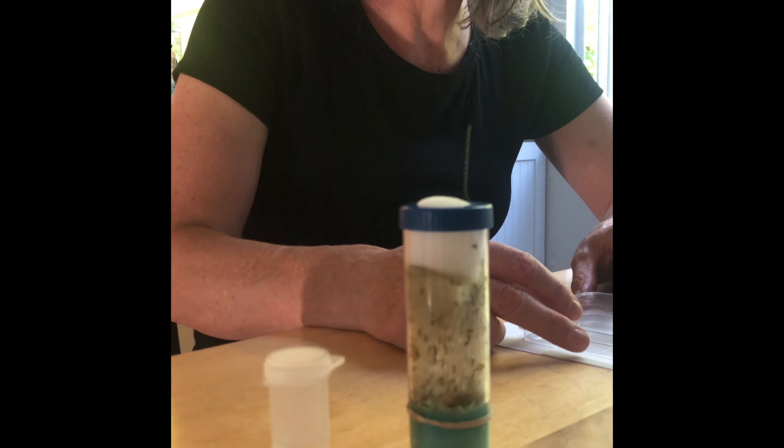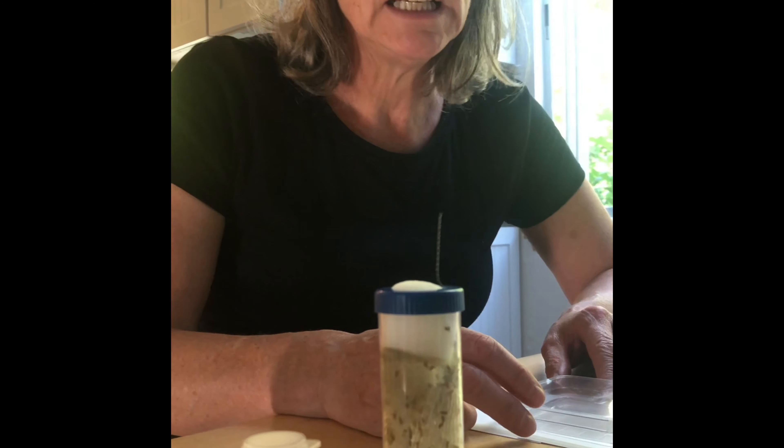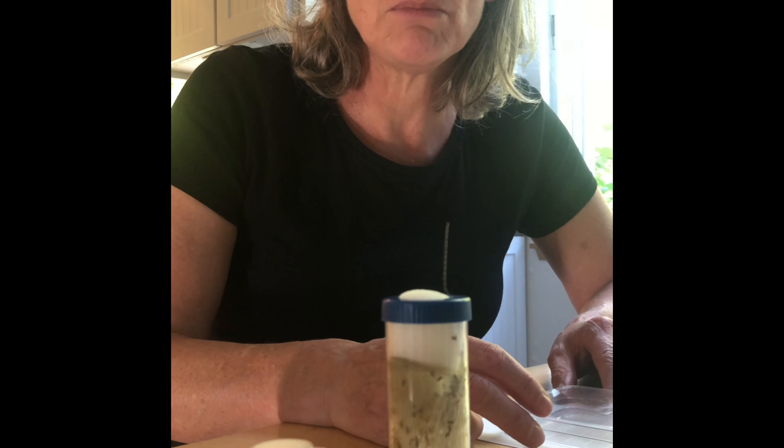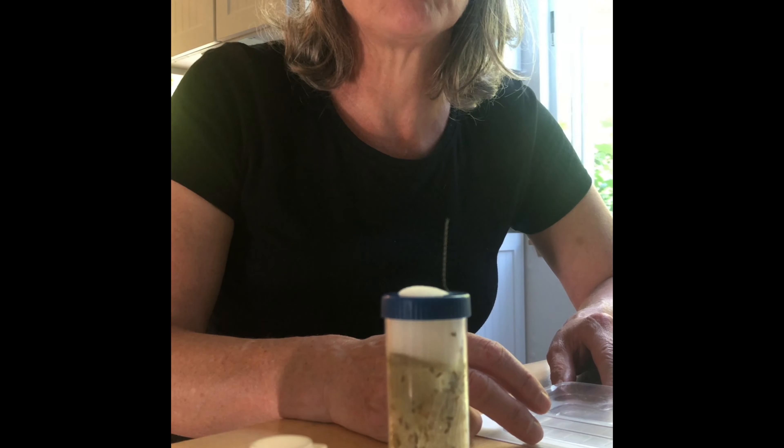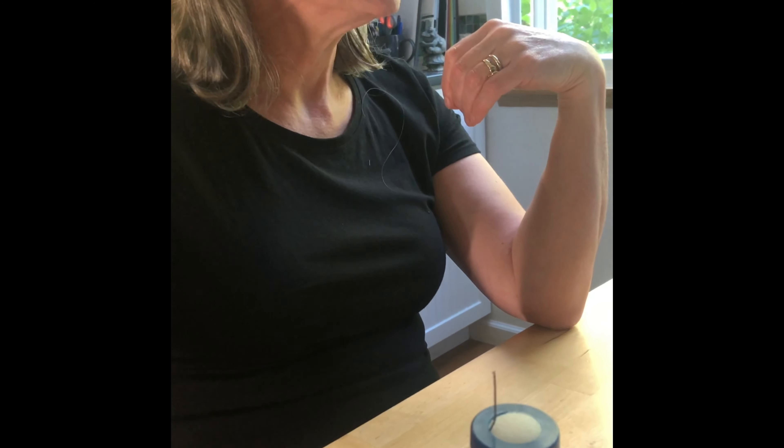What we're going to try and find out is if the magnification on the iPad or iPhone is sufficient to allow us to both sex the flies and score them for eye color. I'm looking forward to doing that.